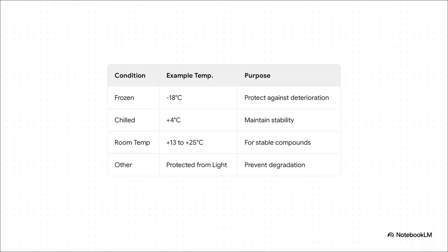GLP requires facilities to provide a whole range of controlled conditions, just like you see here. This isn't just about being tidy. It's about ensuring the identity, concentration, purity, and stability of every single item is maintained from the start of the study to the end.